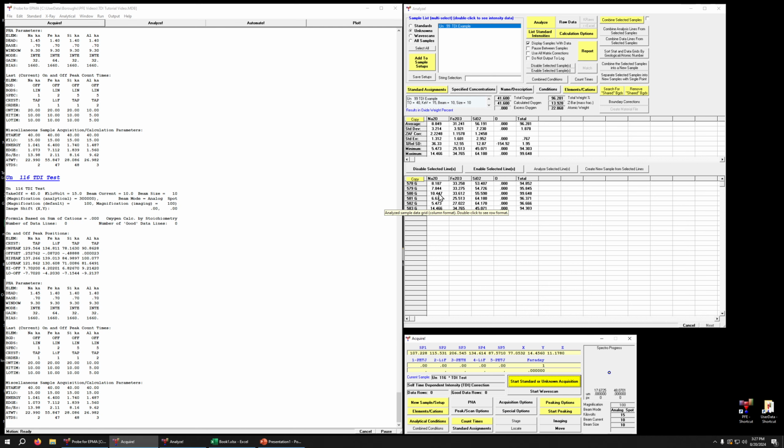You can always disregard the corrections after the fact, but if it is not enabled in the first place, you can't collect that data, so there's no way to retroactively get the interval data. The only drawback to enabling TDI is that there is a bit of extra analysis overhead time required for PFE to collect and store those intervals.